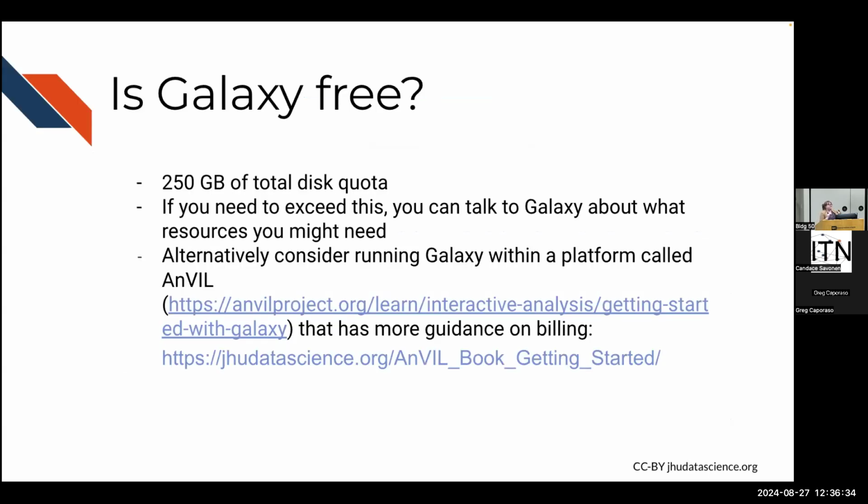So is Galaxy free? The answer is mostly yes. It gives you 250 gigabytes of total disk quota, and it's going to be pretty difficult to exhaust that. But if you need to exceed this, what do you do? You talk to Galaxy Help, or you consider alternative platforms like Anvil, which also brings in protections for data.